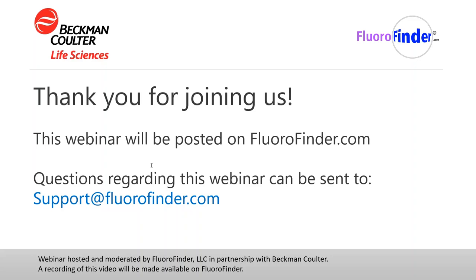So in that case, I think, and this is really the way the field is taking, we know that the sensitivity or the specificity of skin prick testing is not as ideal as it could be. And this is why it is usually acknowledged that it can benefit from other approaches. So I more see BAT as an additional approach to complement the current allergy testing landscape, and this is really the way it's going. So I think now that the approach is democratized, we'll see more and more people using this approach, hopefully, and then the true usefulness of this approach will be challenged.